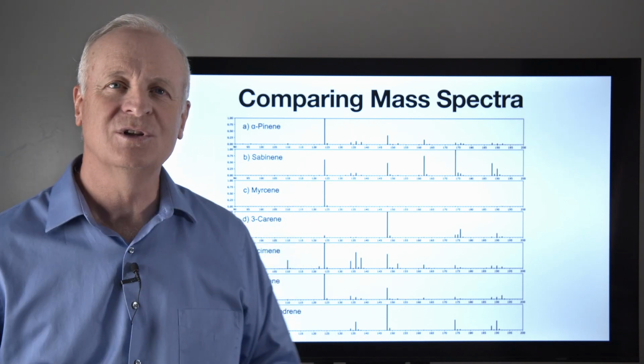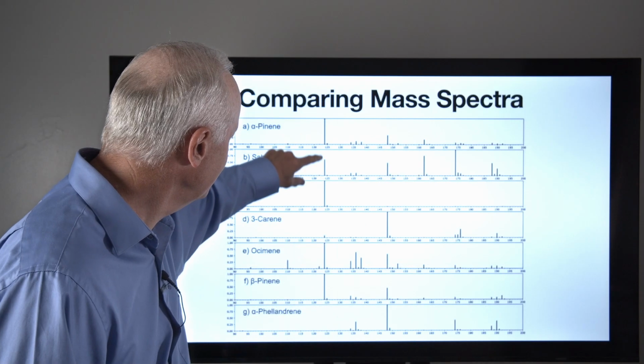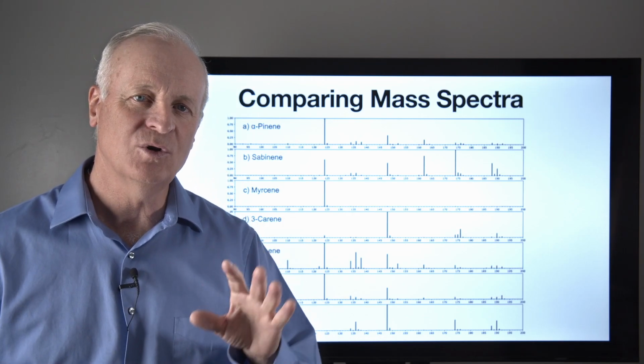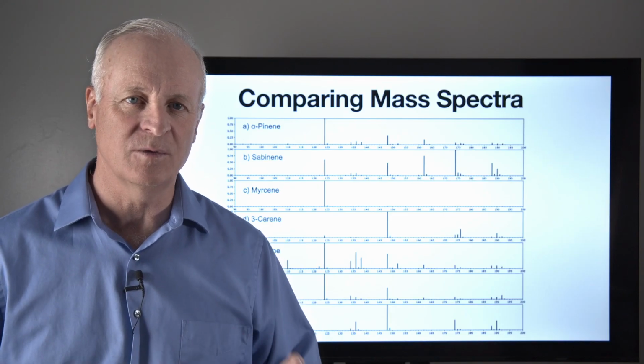Do any of them look alike? Well, they look somewhat similar. They might have the same masses, like this one. Seems to be very common. But they're different because the chemical structure of each of the molecules is very unique from each other.